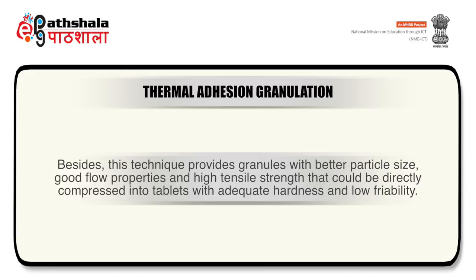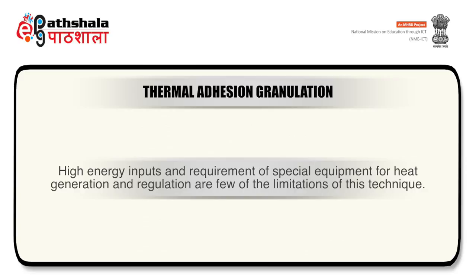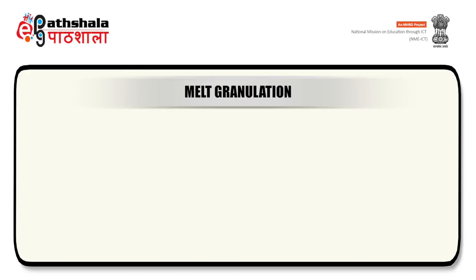Besides, this technique provides granules with better particle size, good flow properties, and high tensile strength that could be directly compressed into tablets with adequate hardness and low friability. High energy inputs and requirements of special equipment for heat generation and regulation are a few of the limitations of the technique. Now let us understand melt granulation.